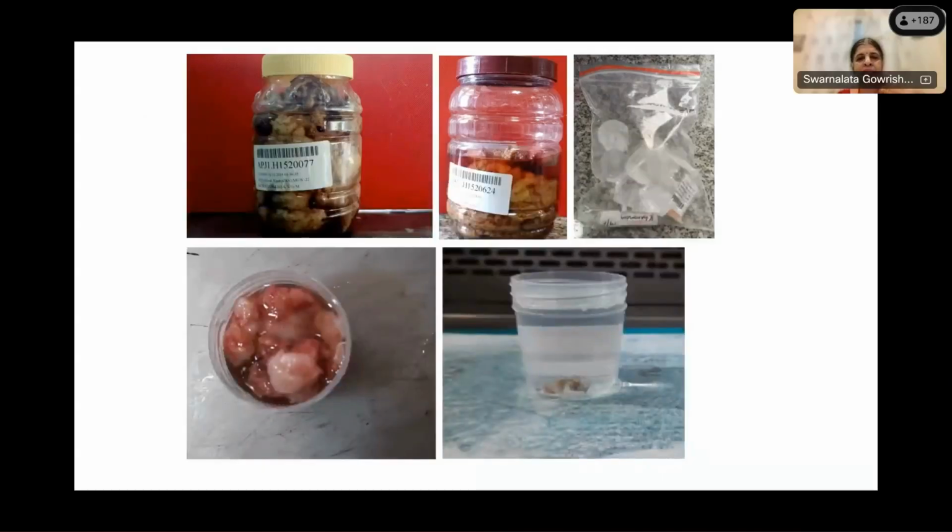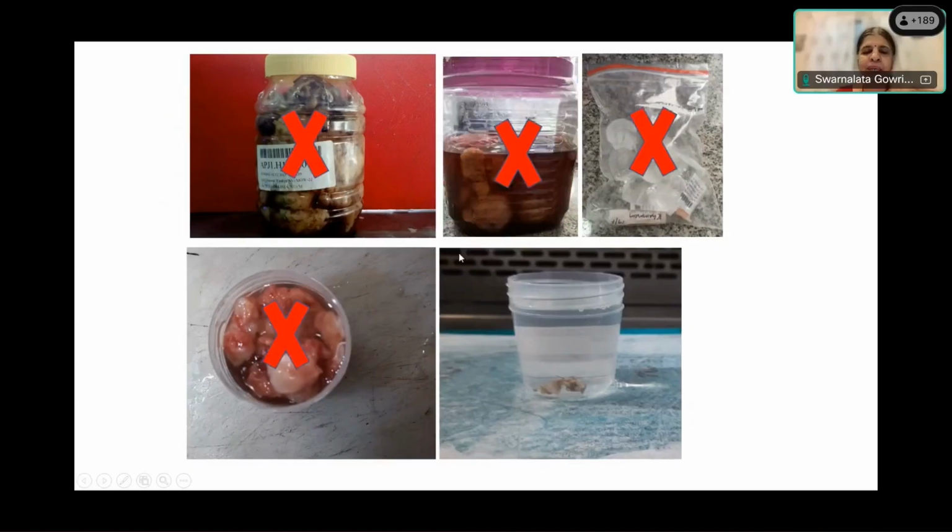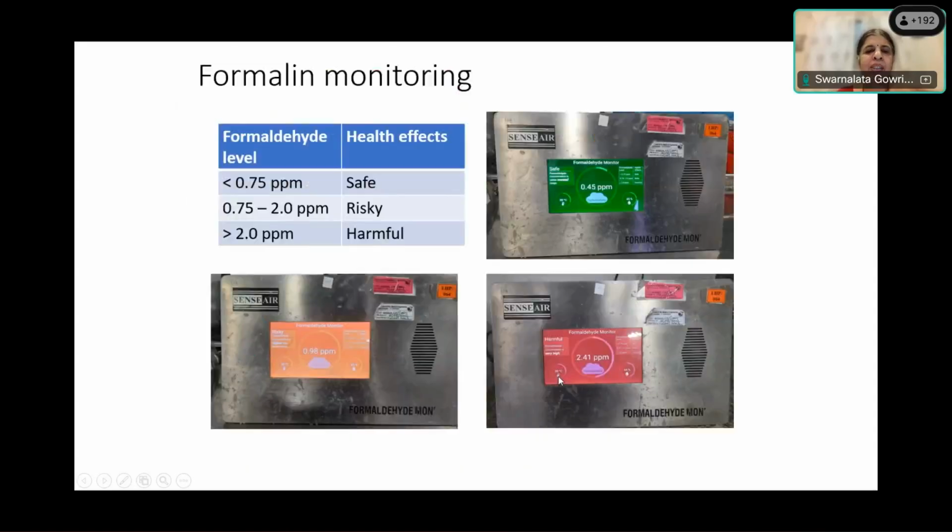So here are 5 examples I have taken of tissue received in our lab, and you need to tell me which one is the right one. So which is the right one? This is right, because this one is, like I said, far too large, stuffed into a small container, inadequate, discolored. Here the tissue is in ice and not in formalin, and here again inadequate fixative. So this is very, very important. You must have enough fixative for the tissue.